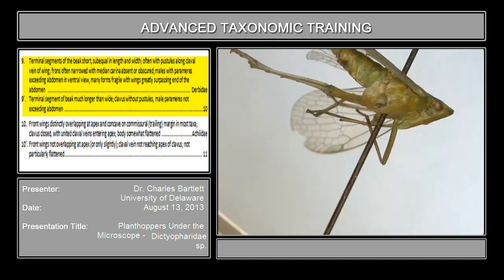Couplet 9 asks about the terminal segments of the beak. The beak is right here — you can see a couple of stylets sticking out. Here's the terminal segment: it is much longer than wide, and it is as long as the segment that precedes it. This is clearly not a cercopid, so we'll move on to couplet 10.